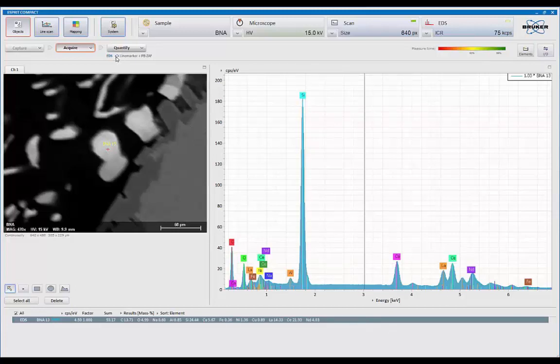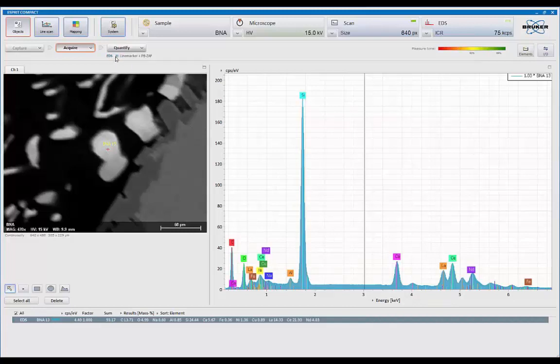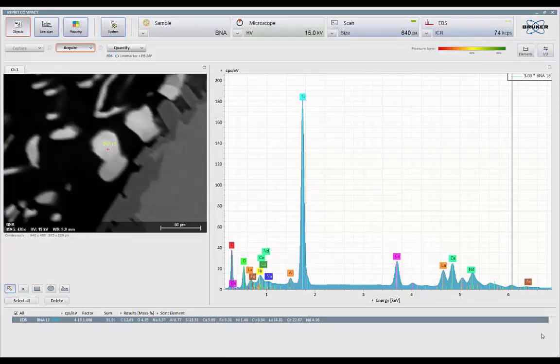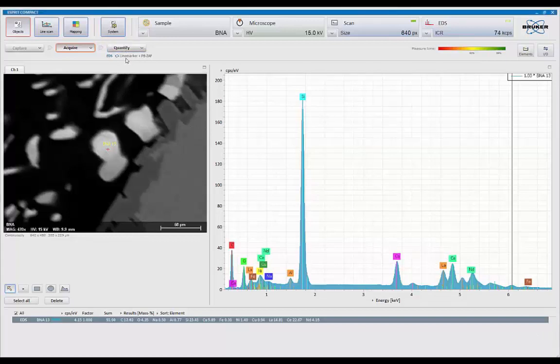And in this mode, this becomes interactive. So I can use the same tools that Auto ID is using to see my results. Basically, Auto ID is doing a full quant. And right now, if I hit quantify, it will just take my ID using the line markers and PB-ZAF and give me the results.